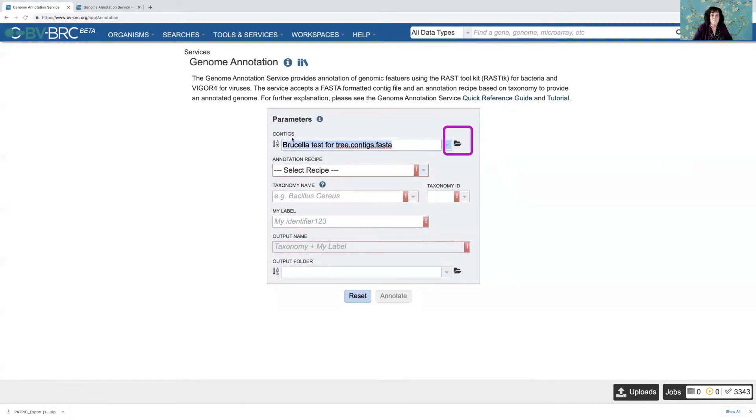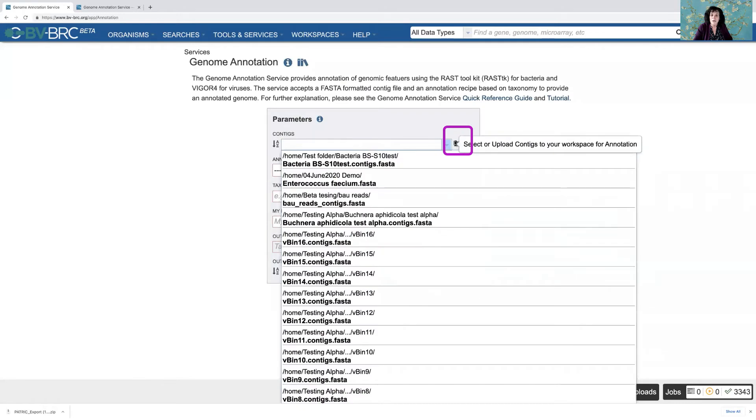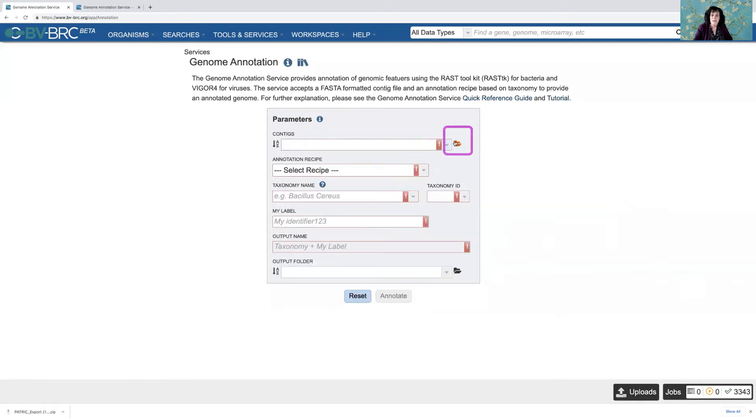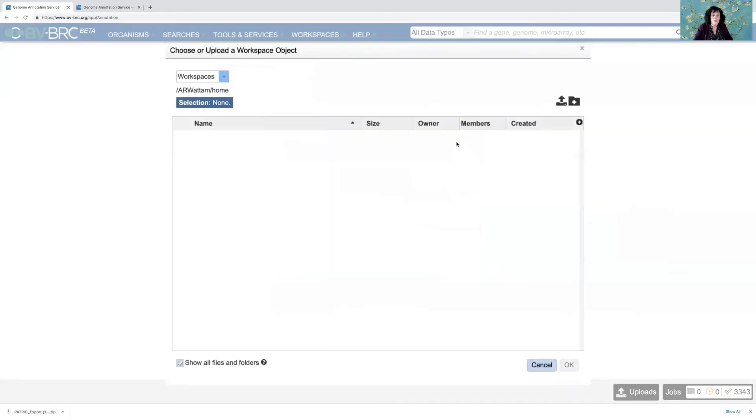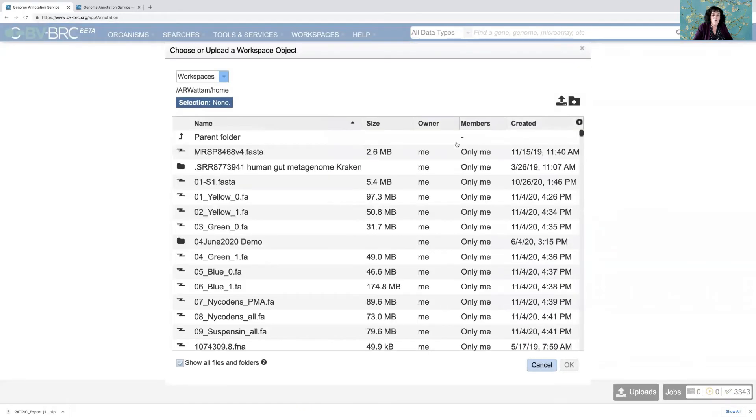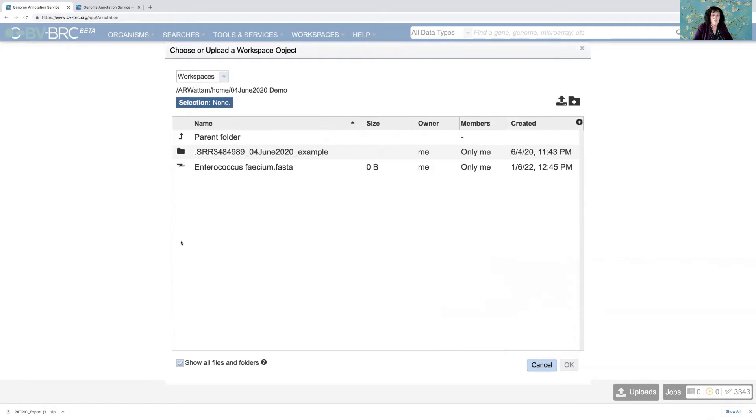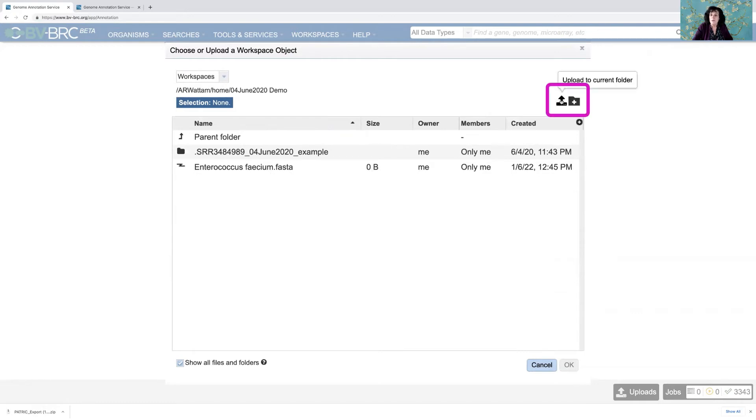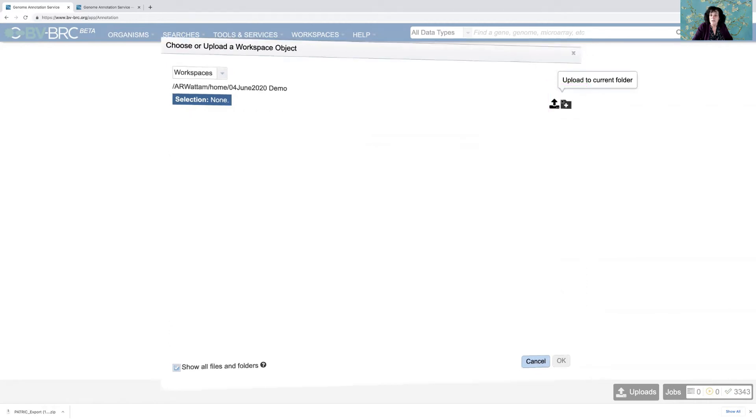Or I could navigate to my workspace and look for specific contig files to see if that's what I wanted. Look, that one's zero base pairs, I don't want to use that. But here I could also upload some data. So let's click on the upload monitor.